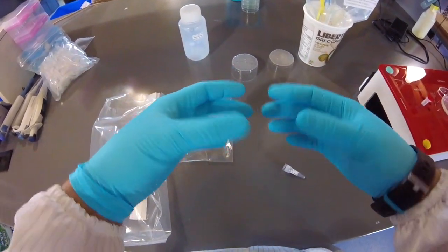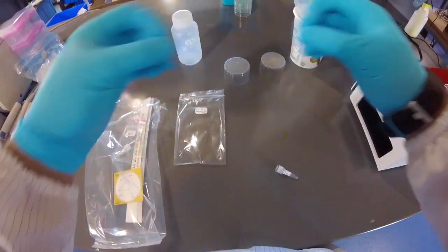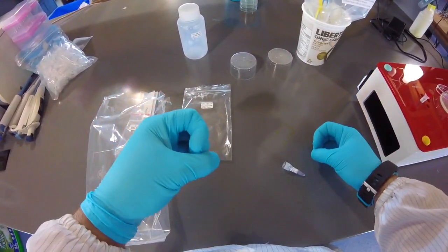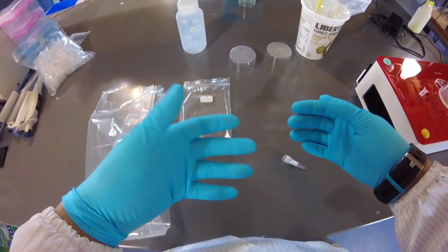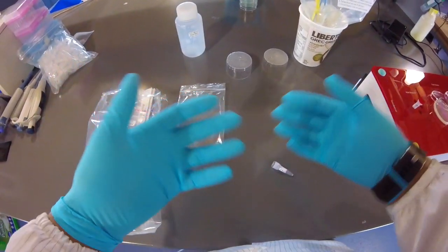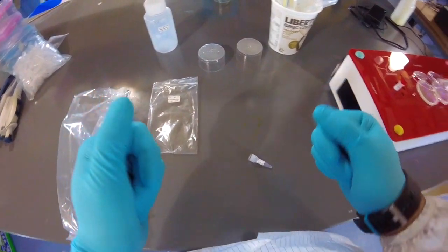But because within this plasmid you have an origin of replication, you have many copies, so every cell that divides, the daughter cells get a plasmid, and they can continue to replicate and copy those plasmids so that you can ultimately see your trait in thousands, millions, if not billions of cells, okay?